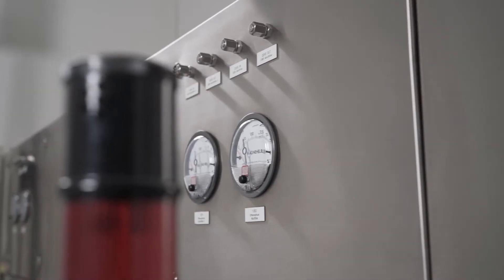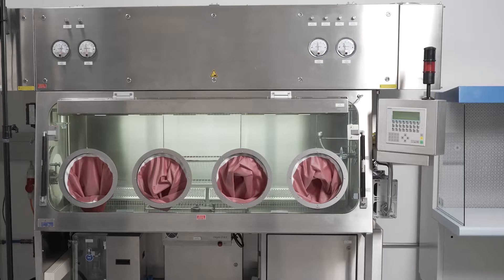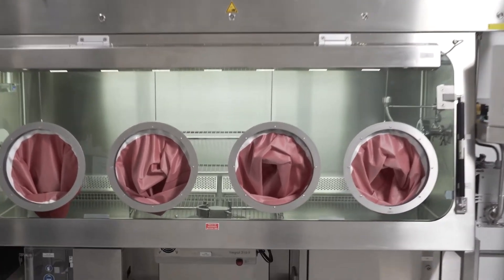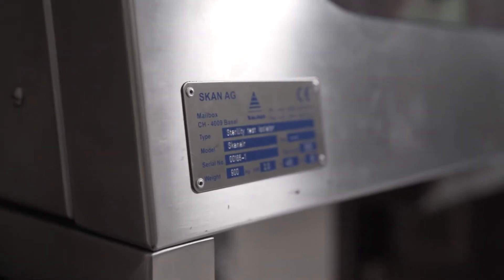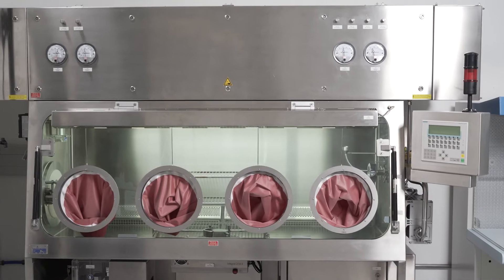Dear isolator user, we would like to congratulate you for the great decision you made about 15 to 20 years ago. You bought a state-of-the-art equipment for sterility testing from SKAN with highest quality and safety. But now you will think: do I have to invest into a new isolator, or can I invest into a retrofit of my classic isolator?